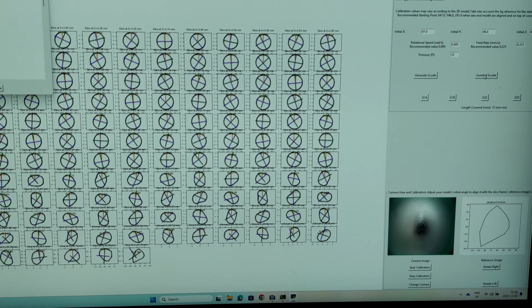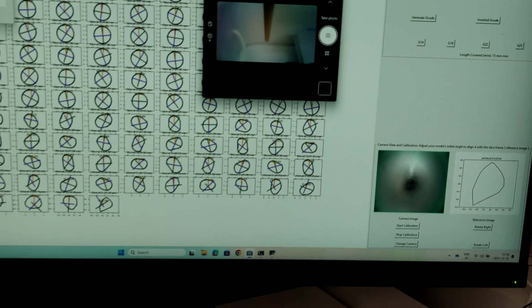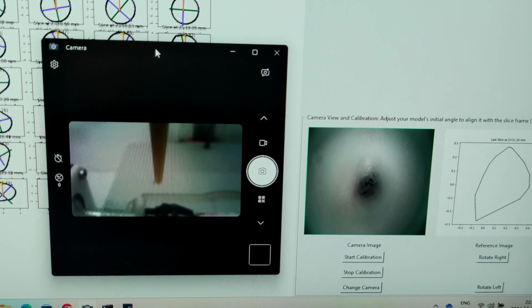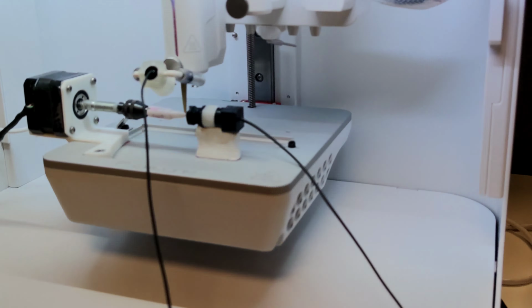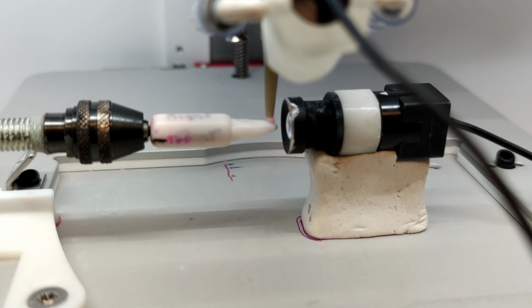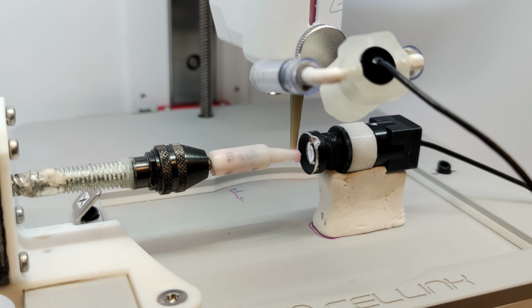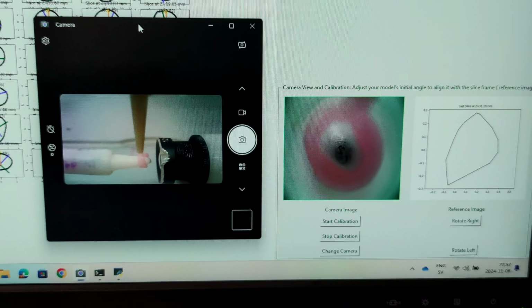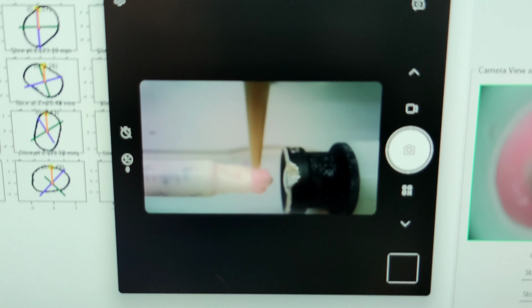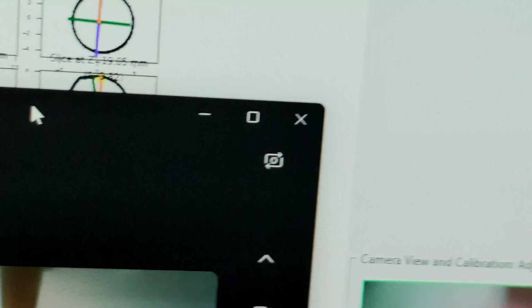So now we're gonna send the inverted G code, send this. So now we can visualize as well a close-up while it is printing. So now we need to change to the rotational axis, and let's see. So now it's starting the print. We can visualize as well, as you can see here, but you can visualize here as well. So while it is rotating, it is printing, and as well here, while it is printing, just to monitor that everything is alright here.